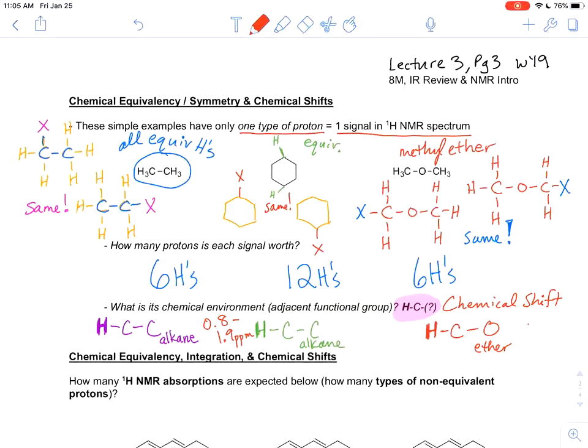Okay, so that's where we'd expect diethyl ether to show up, dimethyl ether. And I have that on the second page, and you guys can see all that. What's happened before page 3 in the lecture webcast. So now we're kind of caught up. Sorry, this is the section of the notes that I went over in lecture.